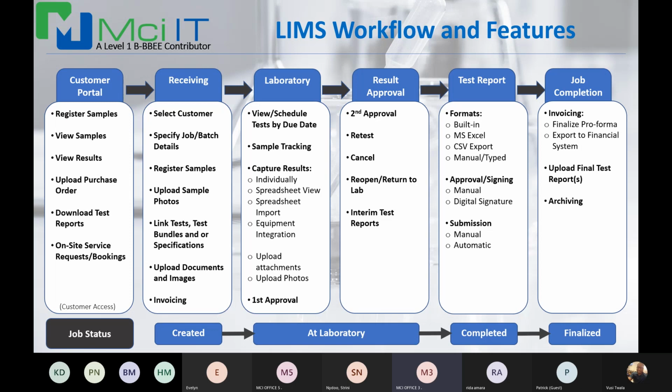The laboratory would need to receive those samples, register them in their system, and assign the necessary tests, and some of the samples may need to be tested to certain specifications in order to measure compliance at the end of the day. So that's the receiving process, and then once that process has been concluded, those samples are dispatched to the laboratory.